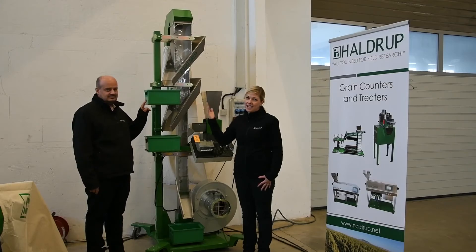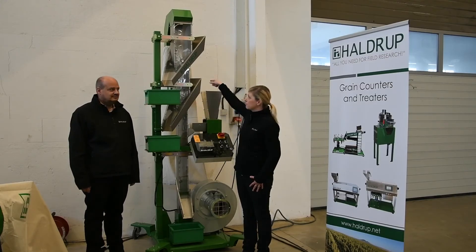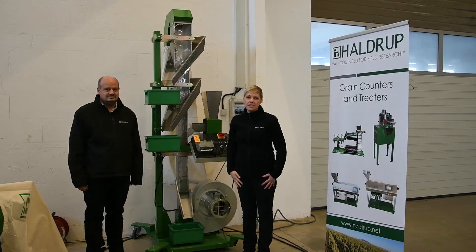On the top you get dust and chaff. This dust and chaff is then collected into the bag which is behind the machine. We can also attach this machine to our dust extraction unit.